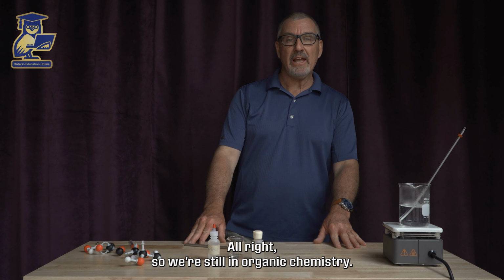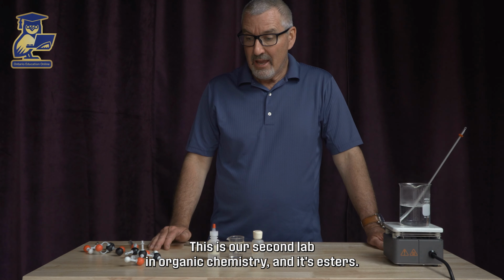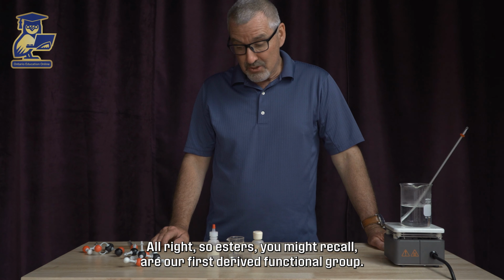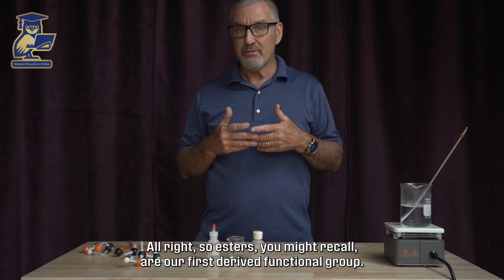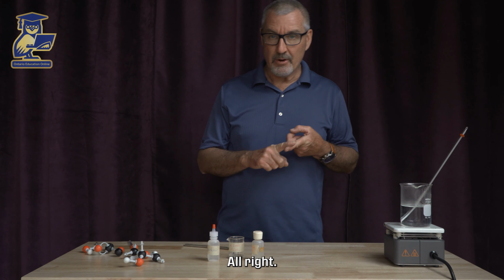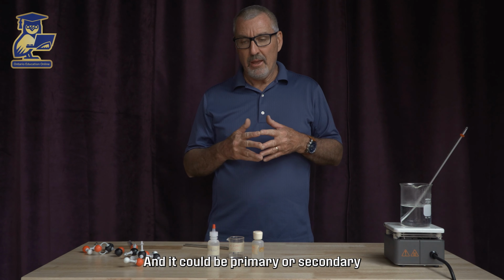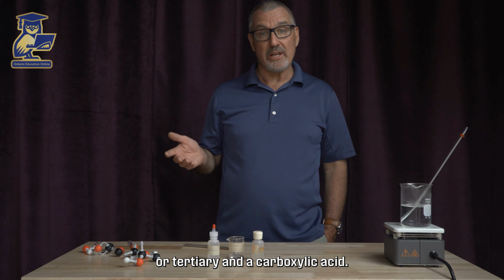Right, so we're still in organic chemistry. This is our second lab in organic chemistry, and it's esters. Esters, you might recall, are our first derived functional group. We make it from an alcohol, and it could be primary, secondary, or tertiary, and a carboxylic acid.